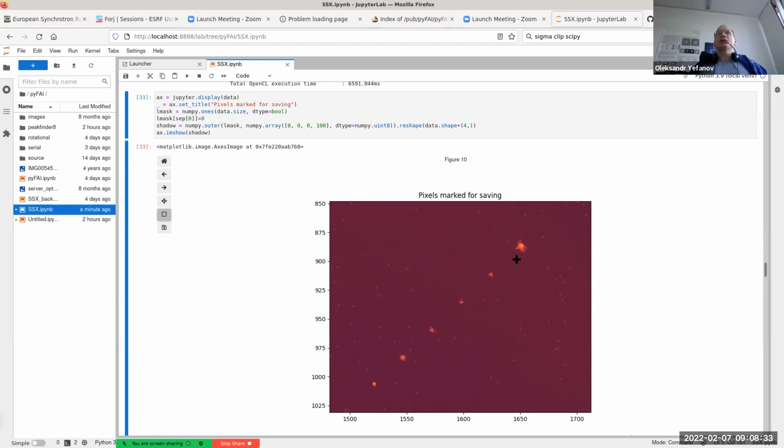But a more interesting problem is that in this way you're saving only positive outliers. But every crystallographer knows that there are Bragg peaks which you cannot see, cannot detect, but by adding up multiple patterns, that's what serial crystallography does, you're getting higher resolution. So by saving like this, you're just discarding resolution to everything you can see.